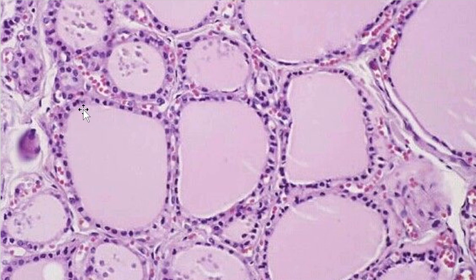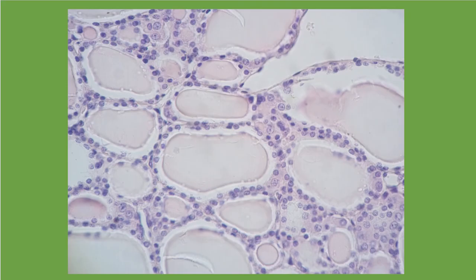Now we also have parafollicular cells in the thyroid gland as well. Those are going to be the ones that's off to the side, in between the follicles. So here would be some right here. This would be some here. Here is some right here. So you kind of get the idea. Now, this would be the follicular cells, and this would be the parafollicular cells here. Okay, we're going to look at a couple more slides of this.